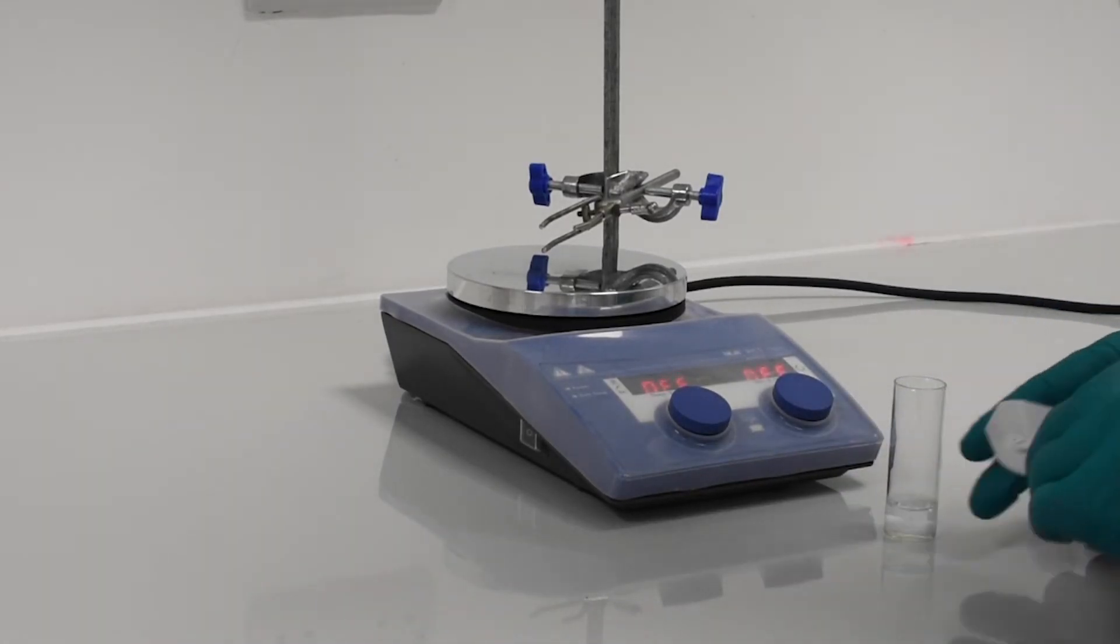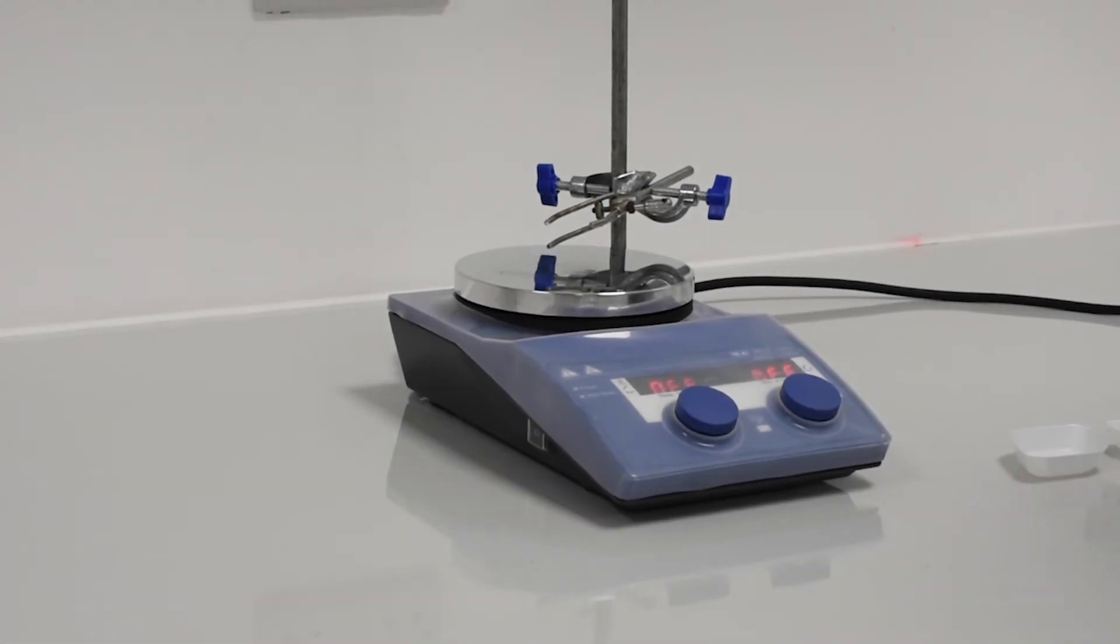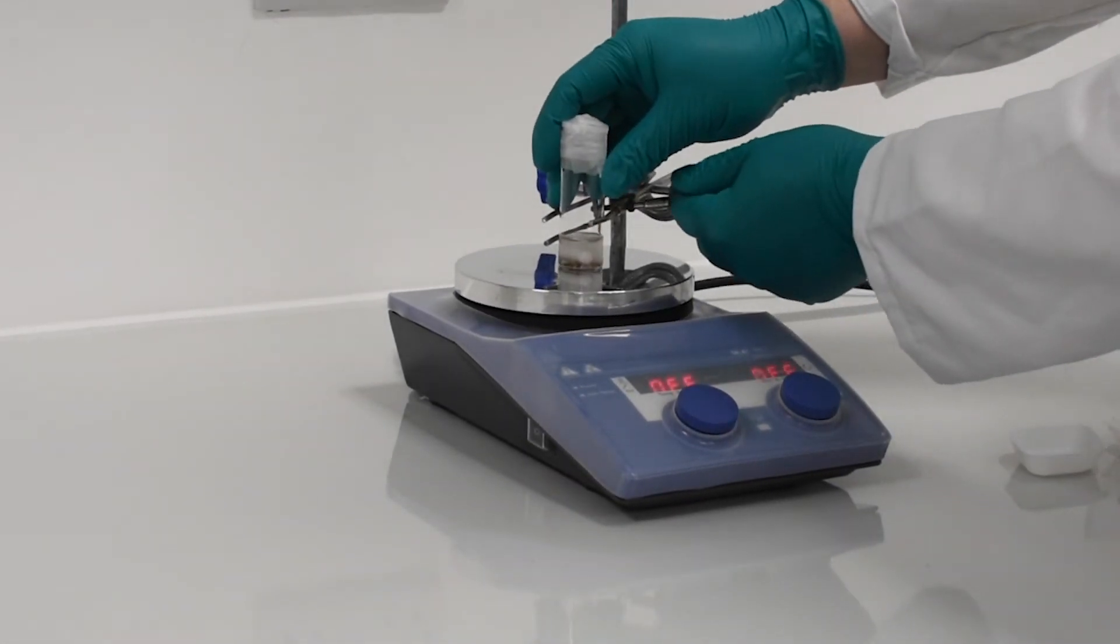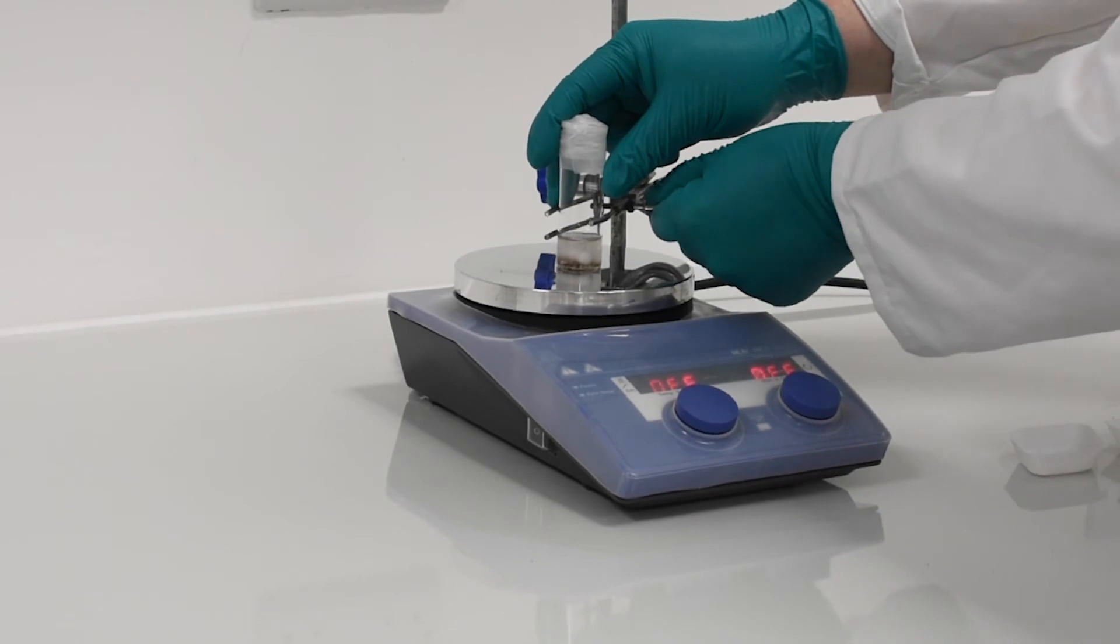In order to simulate the sea and make microplastics, we stirred a vial of water with different plastics and grit for a week at 60 degrees.